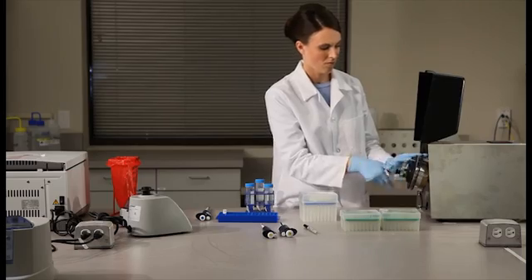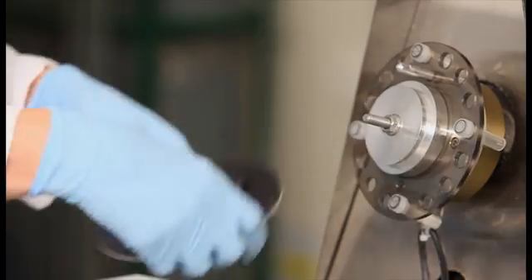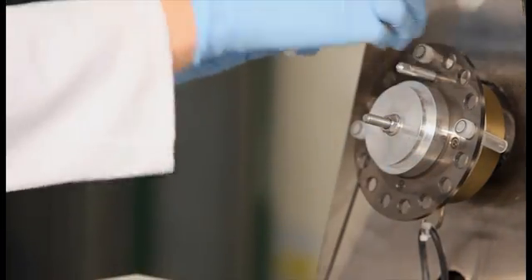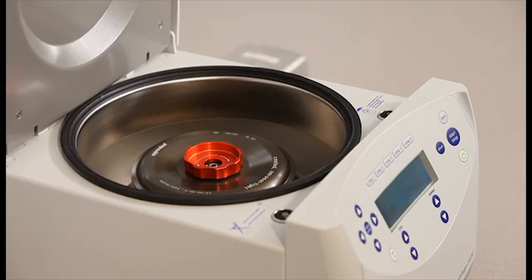Close the safety hood and run the bead beater at maximum speed for 2 minutes. When the instrument stops, remove the tubes and spin for 1 minute at 12,000 G in a microcentrifuge.